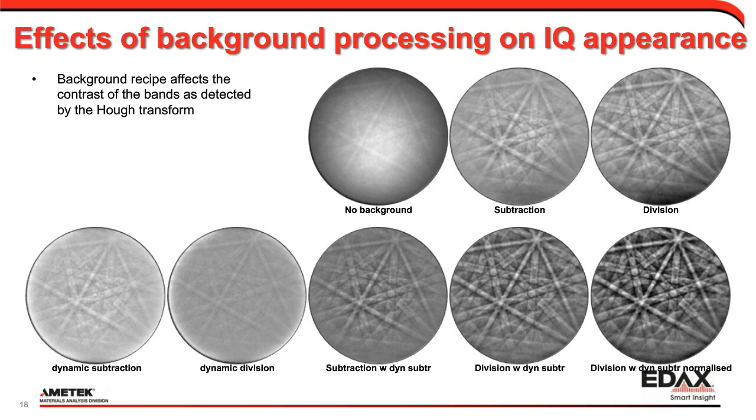So again, it's kind of a moving target, and this is going to actually get to the heart of what I'm going to be talking about towards the end here. Before you do an EBSD scan, you have to think about all these things. But what if I could think about it afterwards and not have to worry about the background so much ahead of time? That's the meat of this talk.